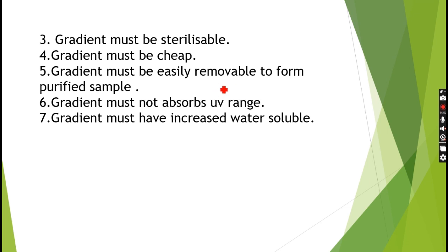The gradient must be easily removable to form a purified sample. If it is difficult to remove, it may cause a decrease in purity. If the gradient is attached to the sample and it is very difficult to separate, it may decrease the purity.